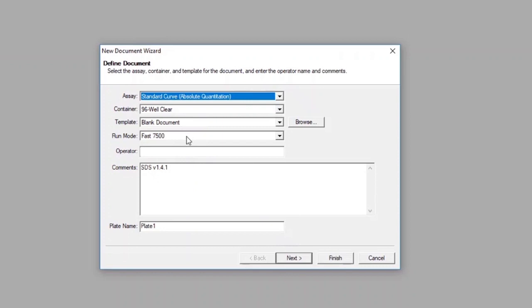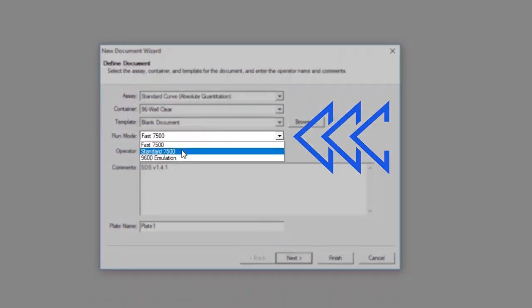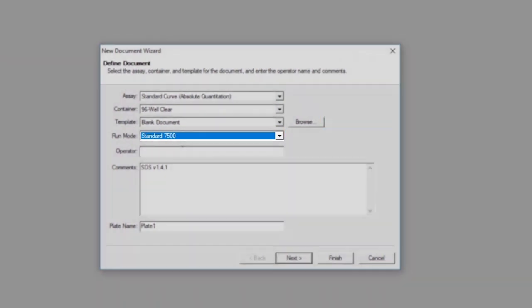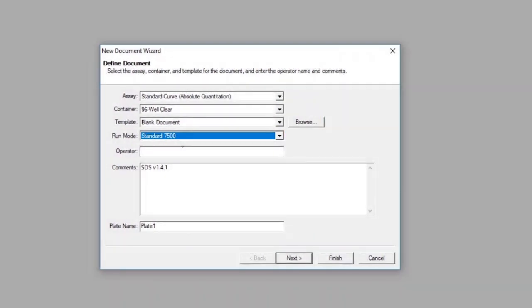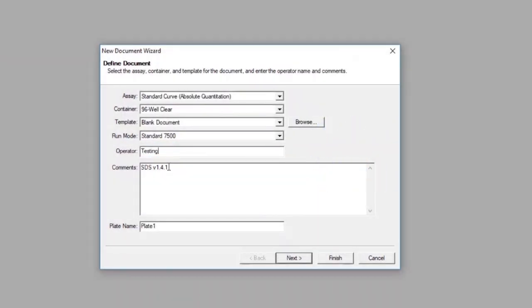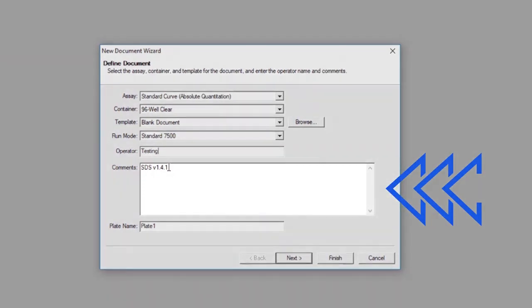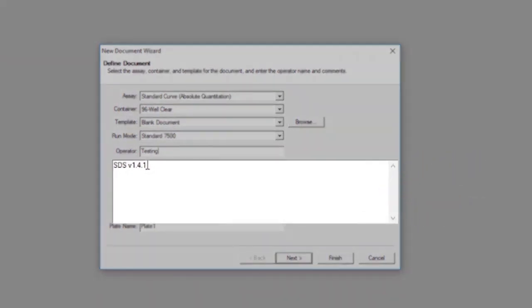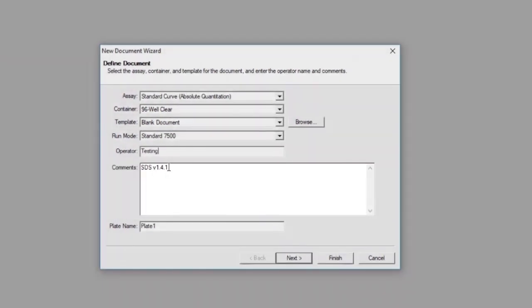For the Run Mode setting, be sure to update it to Standard 7500. The Operator box should contain your name or user ID. The Comments section should contain the version of the software being run — for example, today we're running SDS version 1.4.1.